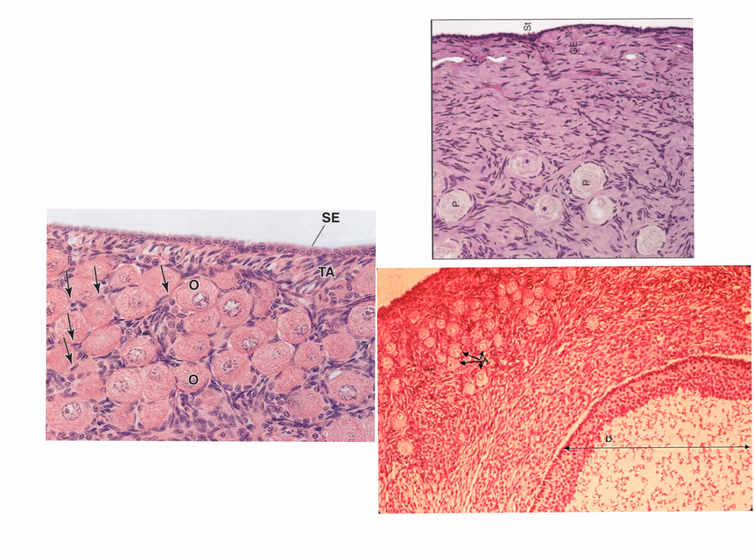Vidya, looking at these 3 histological sections, I'm pretty certain that I'm somewhere within the female reproductive system. Can you help me out and identify exactly what I'm looking at over here? Daniela, we're looking at the ovary. Thank you, that's what I thought.